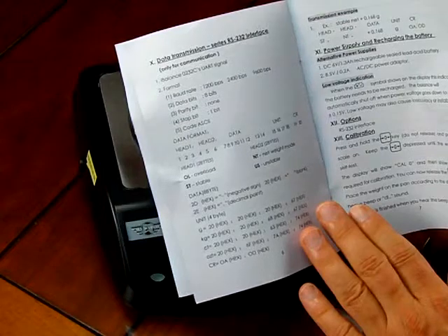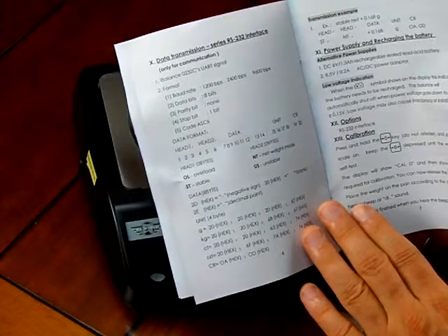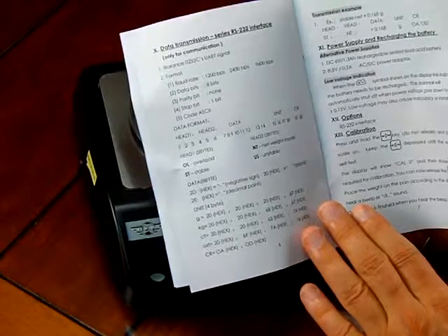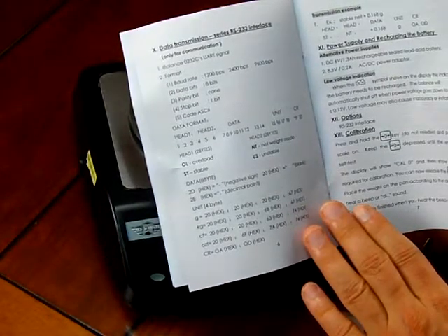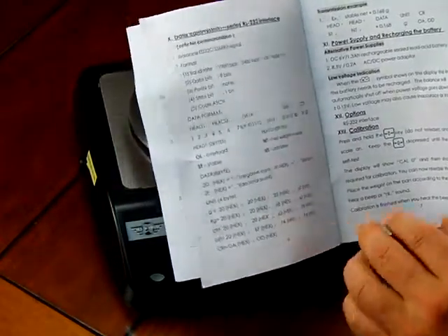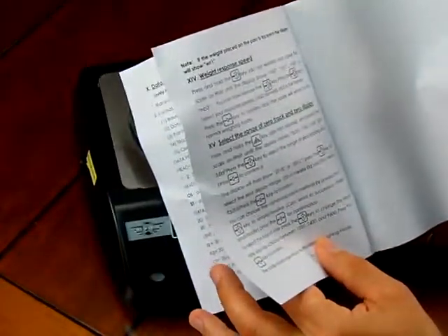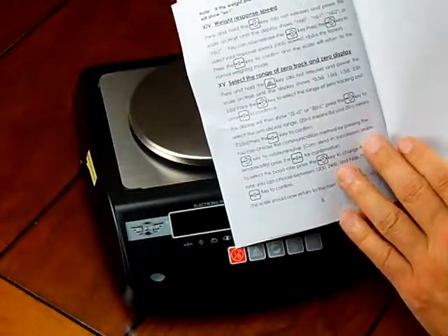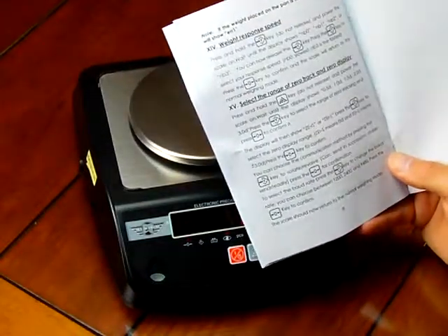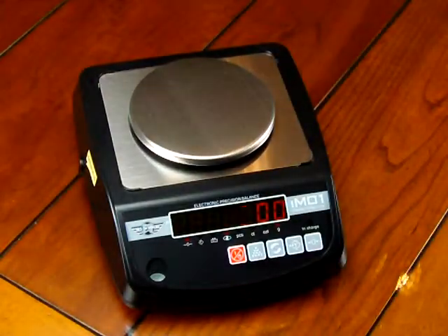If you are looking for a portable scale to communicate with a computer, we'd recommend you look at the A&D EKI series, because A&D also offers software you can download from their website. So although it has an RS-232 interface, we want to stress we're not going to be here supporting it. In the manual you can also speed up the weigh response time and select the zero tracking range, which is like the auto zero function.